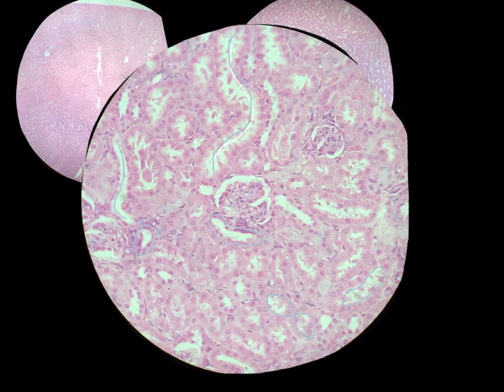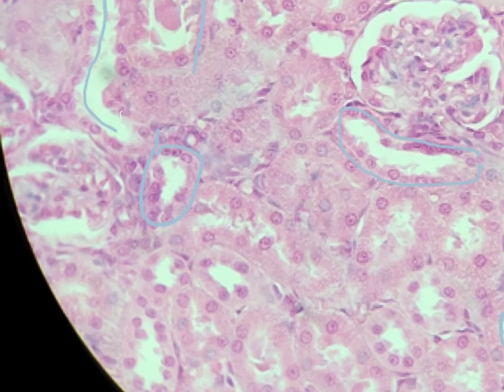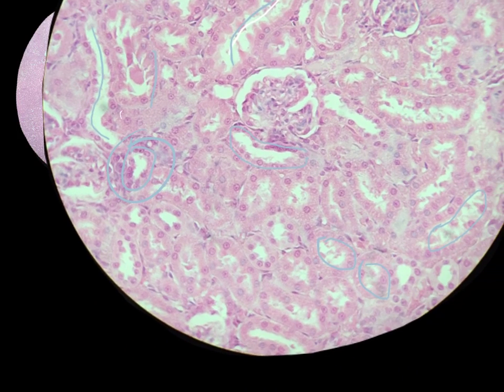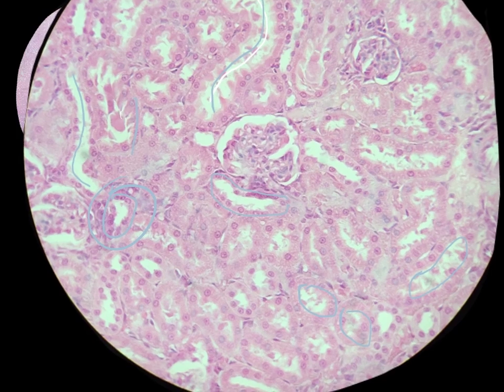And in the distal convoluted tubules, what you'll notice is that in any one circle, one tubule, you will actually probably see all of their nuclei, all of the nuclei of the cells that border it. So in here you can see 1, 2, 3, 4, 5, 6, 7, 8, 9, 10. I'm counting 10 nuclei within this tubule. Whereas if you try that same thing, count up the nuclei in a proximal convoluted tubule.